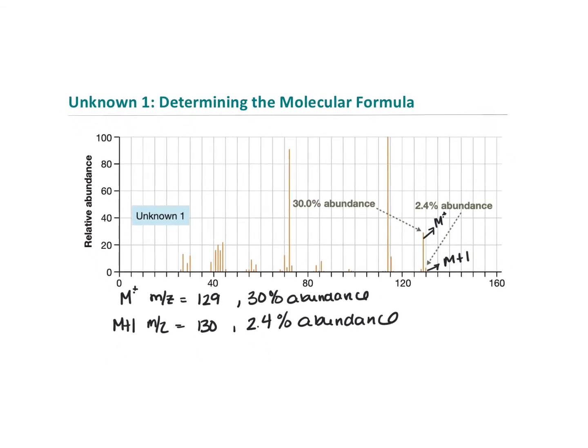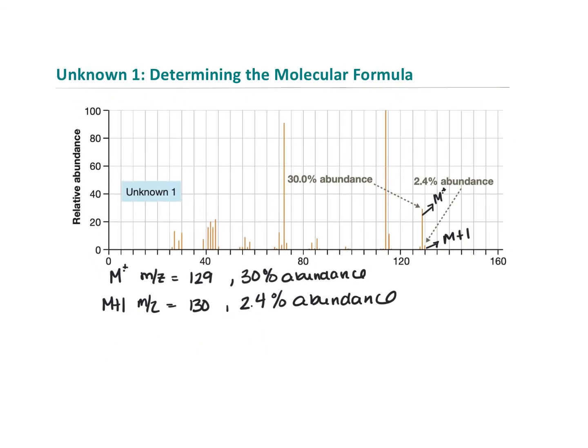Now, that gives us some great information. It tells us the molecular weight of this unknown compound is about 129 grams per mole. That's helpful right off the bat. So that was step 1. Let's look at step 2.